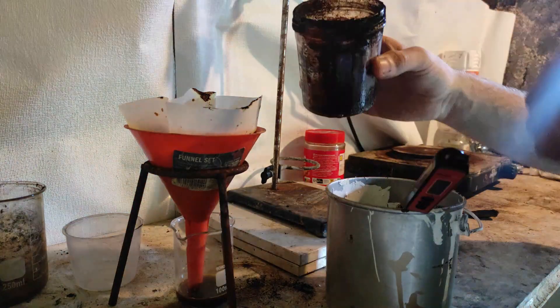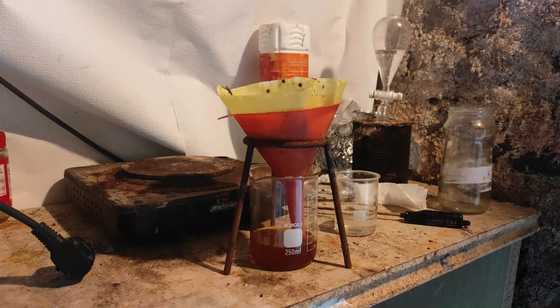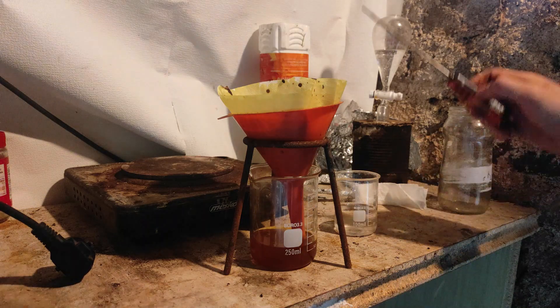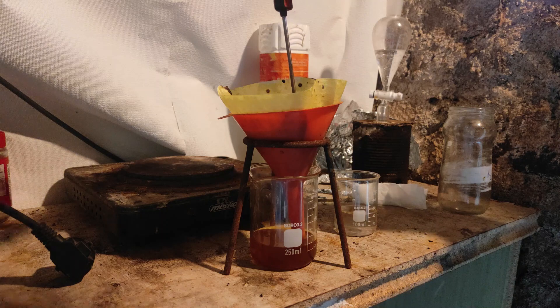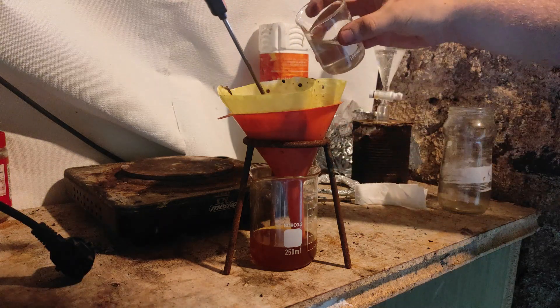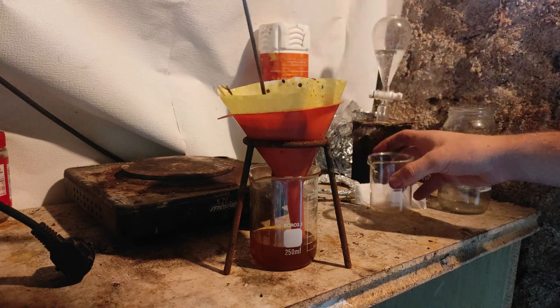You may need to filter multiple times as the oxide particles can pass through. After filtration, we wash the remaining material with more water to get a maximum of sodium chromate in solution.